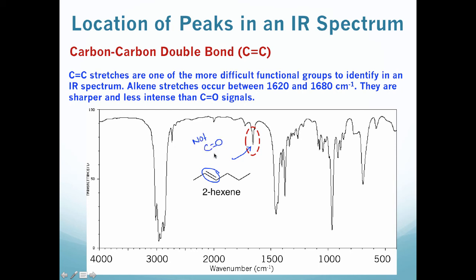But because it's in that double bond region, it's probably a carbon-carbon double bond. Additionally, to confirm this, there's a couple other things we can look for.